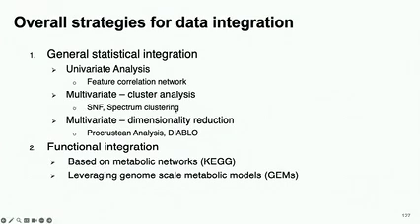And we do have a tool called OmicsAnalyst. We provide a lot of things, but today we are not going to focus on that. We actually focus on the univariate and multivariate analysis, which we call Procrustes analysis, which is relatively widely used. Then there's DIABLO, also doing analysis. They are more linear combinations, trying to explain the covariance. And for machine learning, we are not going to cover it. It's not because it's not useful, it's just that we do not have time to cover it.